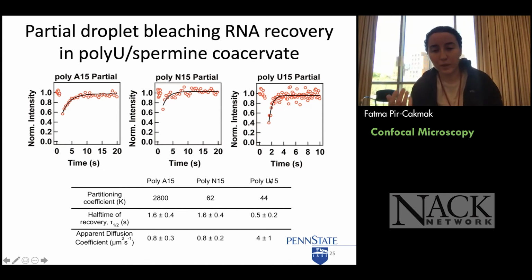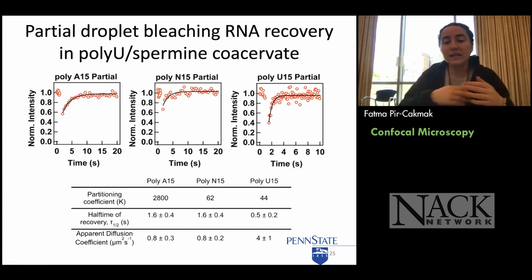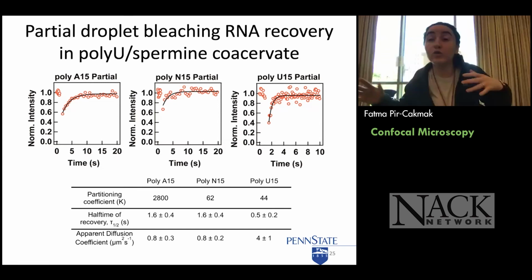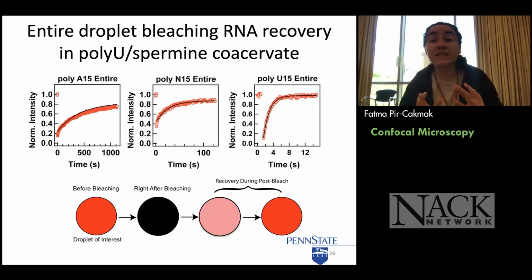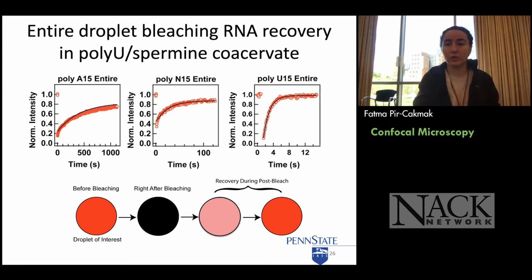Again, you actually see it even fastest, because I think the interactions are not strong enough. It's not attached, and it's more free to move around. Let's look at the entire droplet recovery. It's a completely different story, right?